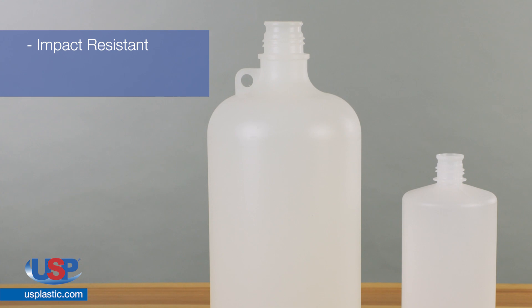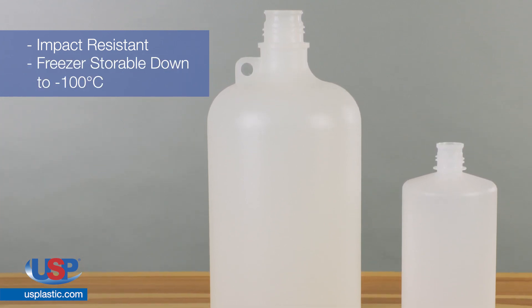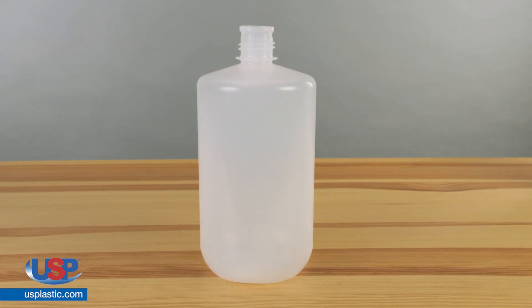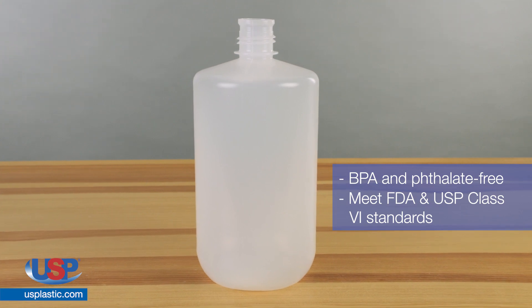These bottles are flexible with excellent impact resistance. They are also suitable for freezer storage down to negative 100 degrees Celsius. Diamond Rio Seal bottles are BPA and phthalate free and meet FDA and USP class 6 standards.